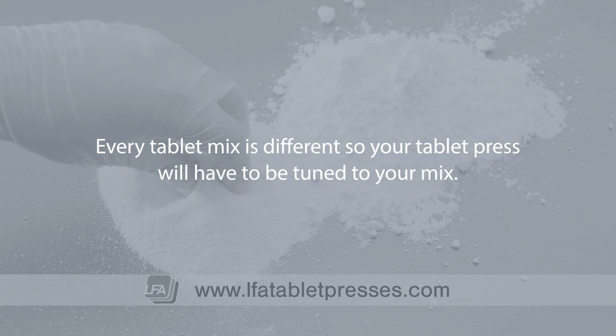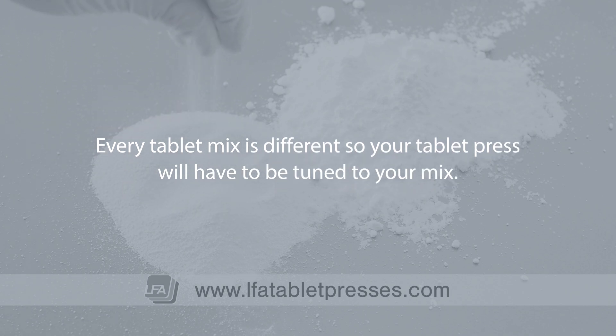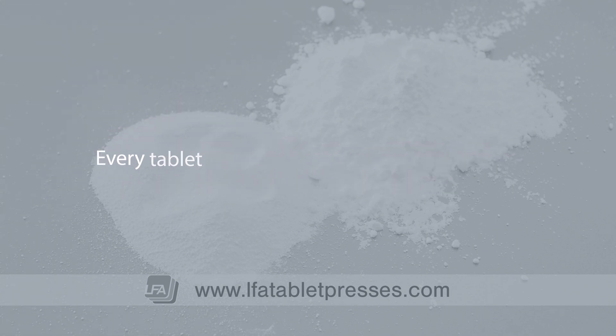Every tablet mix is different, so your tablet press will have to be tuned to your mix. This is a process that should be done in small increments.